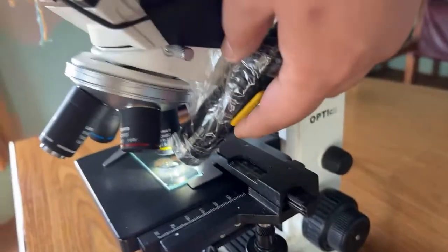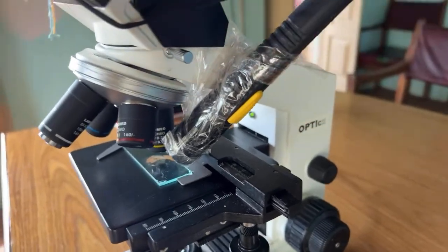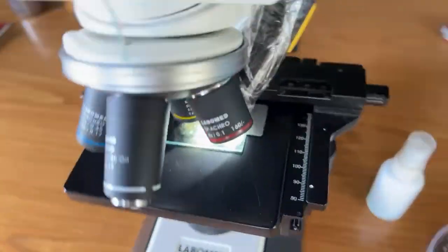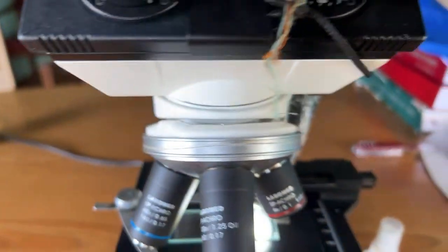So I'll show you. Now it's off, and we see nothing for the time being. We see nothing, and when I put it on, we have the lights. So the light from the torch is falling on the sample, and this is reflected, and then we can see certain things. There you see. Now the benefit of it is that it doesn't give me an X-ray sort of a picture, but a more true version of what we see generally.